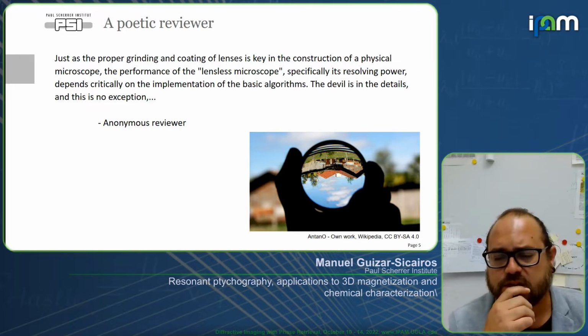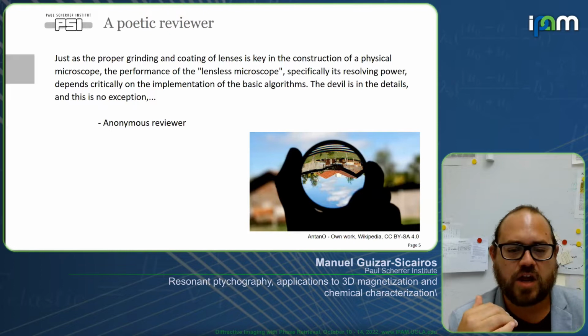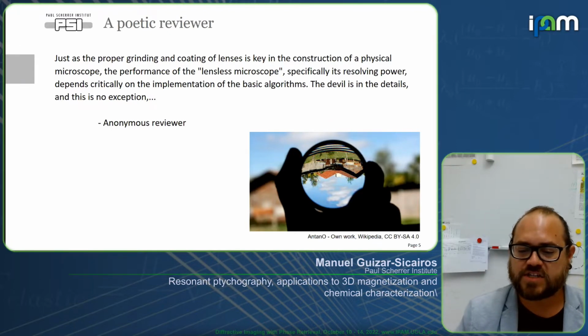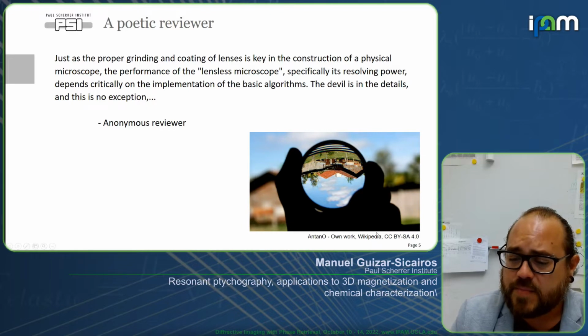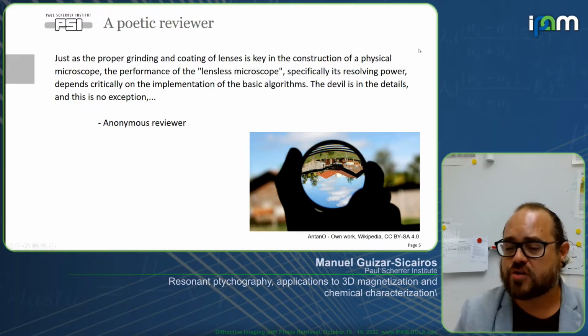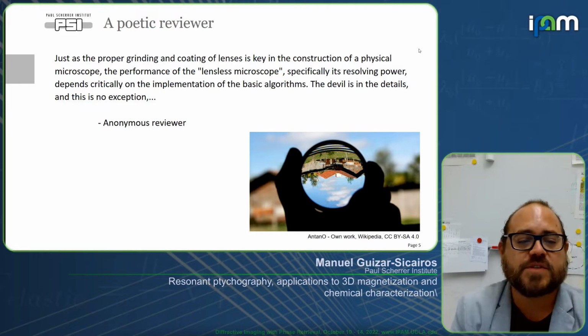So John was also touching slightly on this thing of getting caught in local minima, algorithms that are able to escape local minima. There are also algorithms that are statistically aware of the nature of the statistical noise, for example, like the maximum likelihood algorithms.